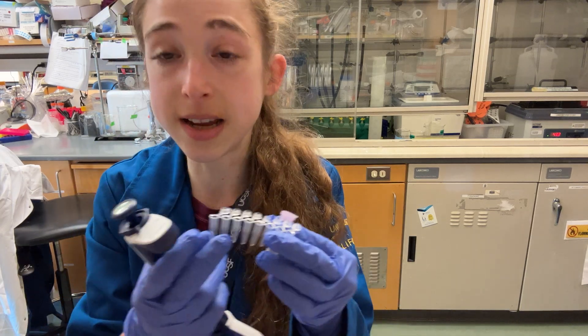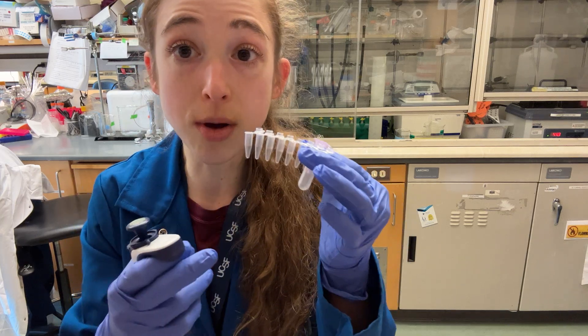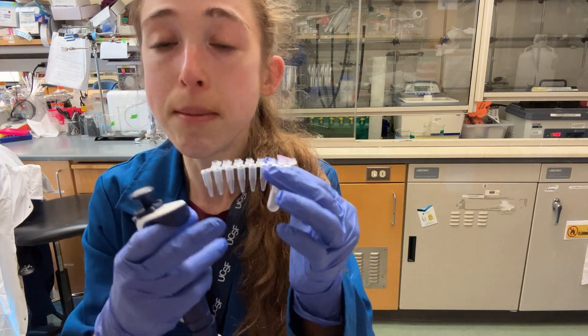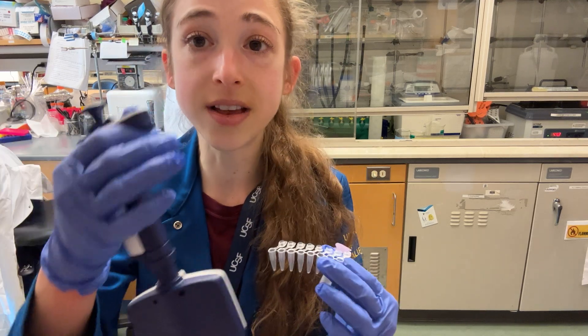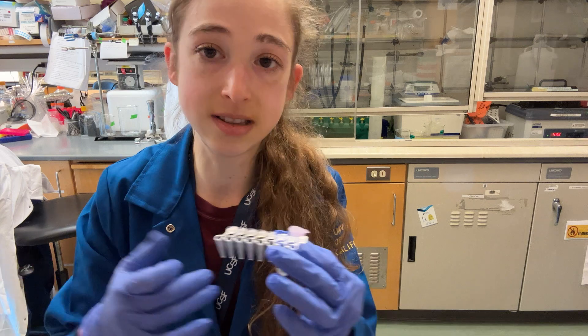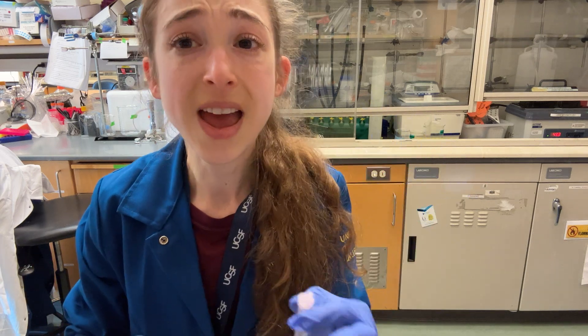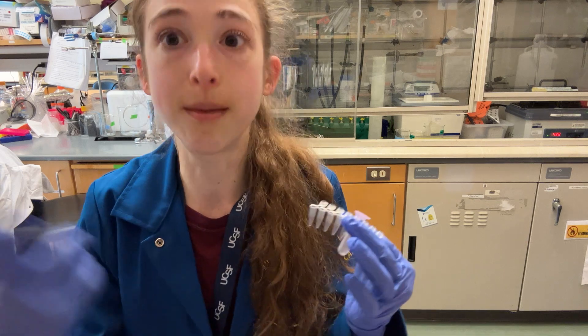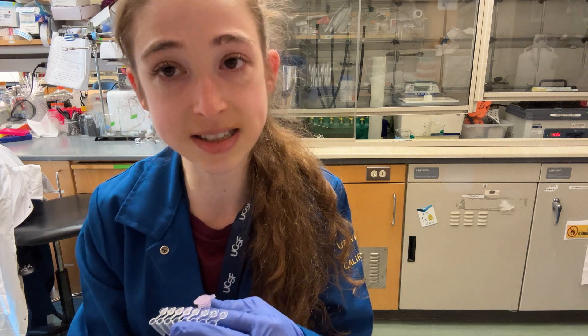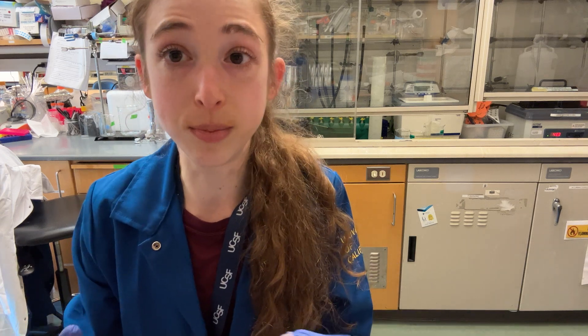If you have a lot of samples that you need to do, what you can do is make them all in a single tube — say, 150 microliters if you want three reactions worth — and then use a multi-channel pipette to transfer that into multiple tubes. Really, the only extra time is the pooling when you go to do your purification. And it's a lot shorter and less wasteful than doing all of that optimization to try to squeeze the most out of that smaller reaction size.